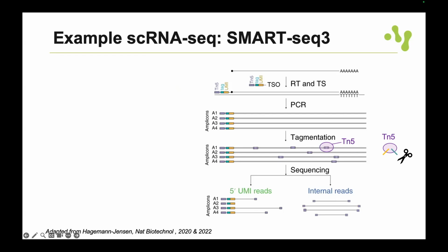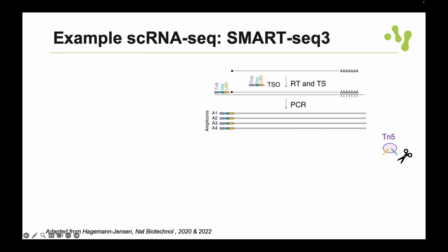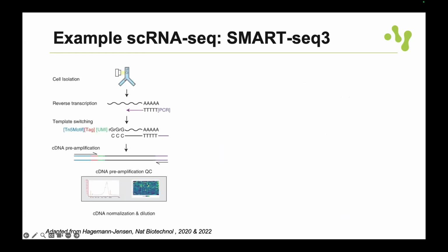I have a question regarding the first QC of the single cell RNA-seq. Do you select a size range for these mRNAs to say this has passed the quality control, like between 1 and 10 kb or something?